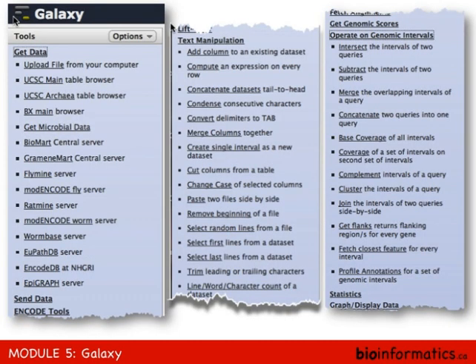On the left side panel, all the various tools are listed. The first one is 'Get Data' — from within Galaxy you can get data from links out to many data sources. Of course, the main one is you can upload a file yourself from your computer or from a URL. There are also the fly people, various model organisms, human, UCSC with 15 to 20 different organisms, ENCODE, MODENCODE, WORMBASE, and all of them.